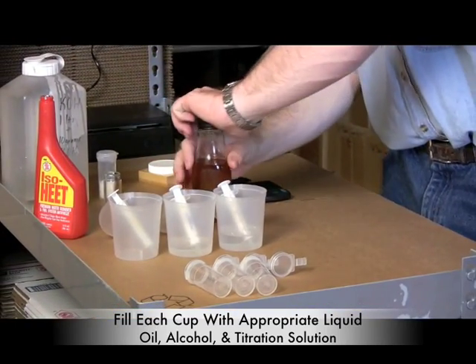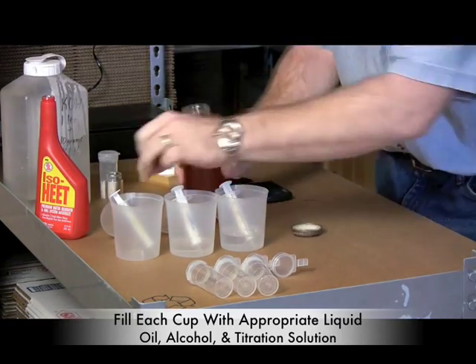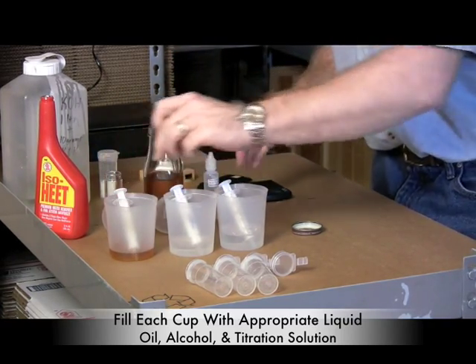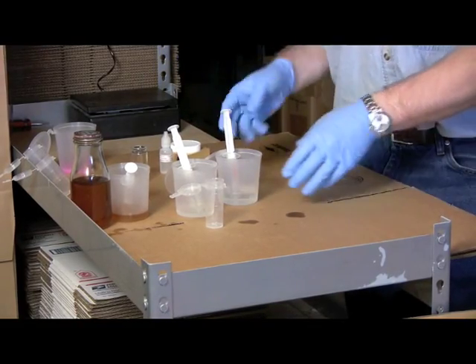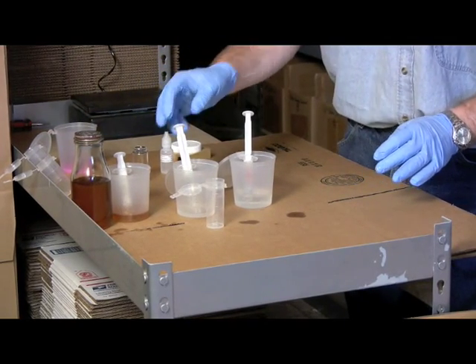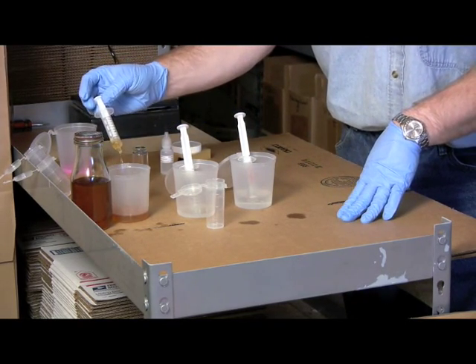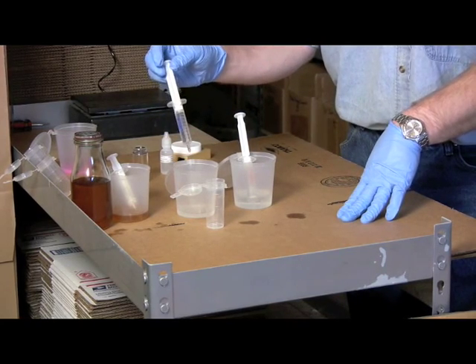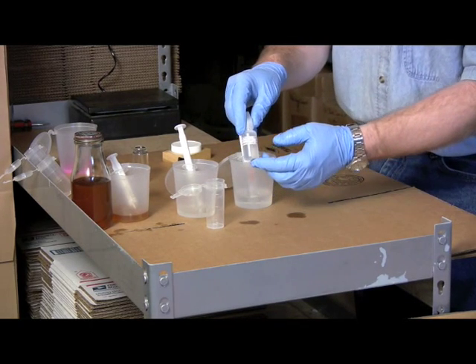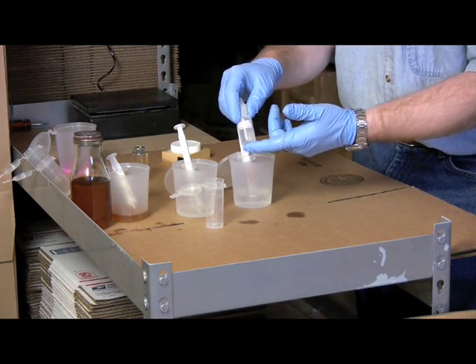For a basic titration, you're going to put one milliliter of oil in with 10 milliliters of isopropyl alcohol. Then add an indicator solution — this is phenolphthalein, which you can get through Utah Biodiesel Supply or at a local pool store. You can also use phenol red or turmeric powder as your indicator.